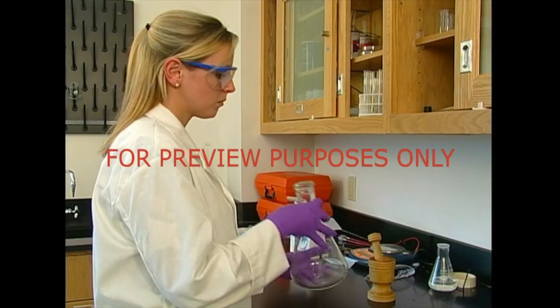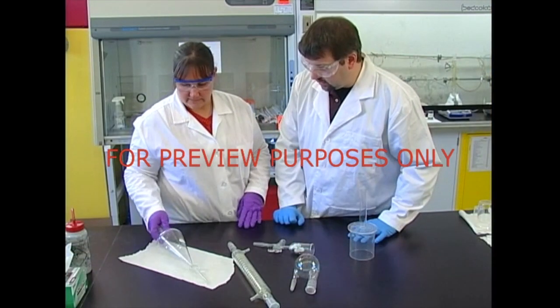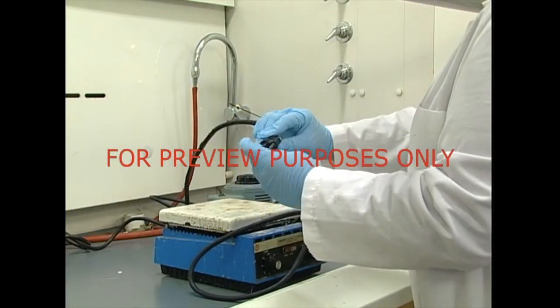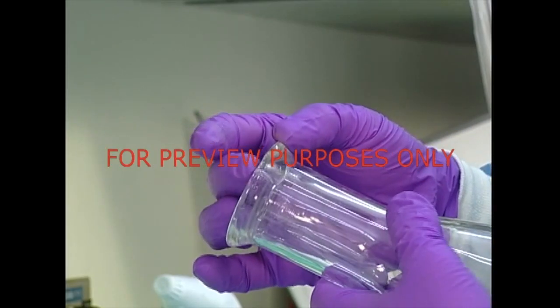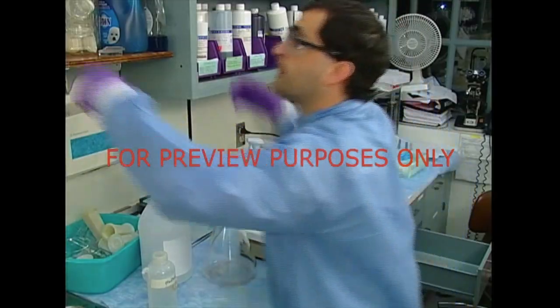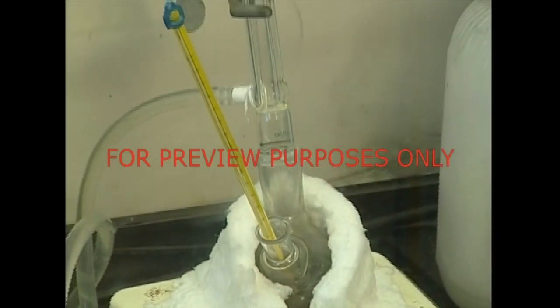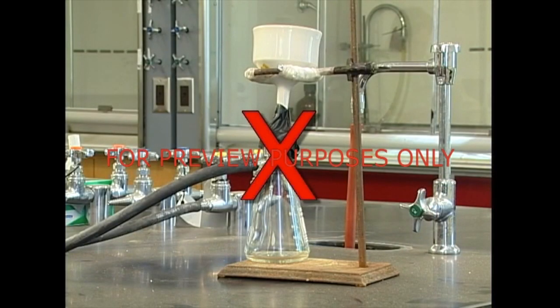It's important for the apparatus and equipment you'll be using in your procedures to be safe as well. Check each piece before setting it up. Everything should be clean and in proper working order. Glassware that is chipped or cracked must be replaced. Any amount of pressure could shatter it. If your work requires specialized equipment or containers, use them. Makeshift substitutes can be dangerous.